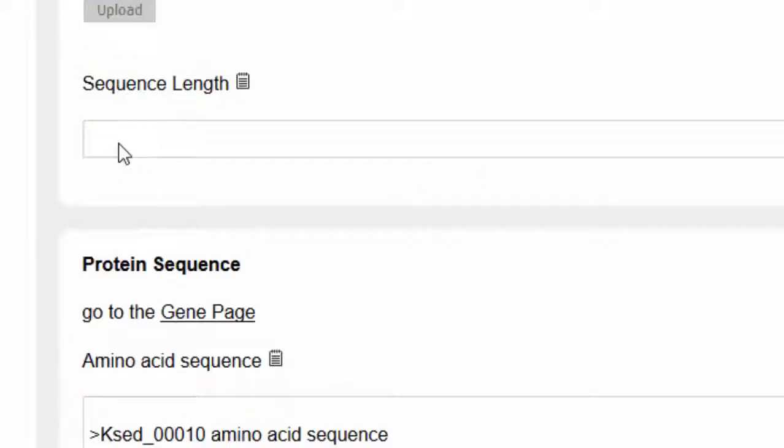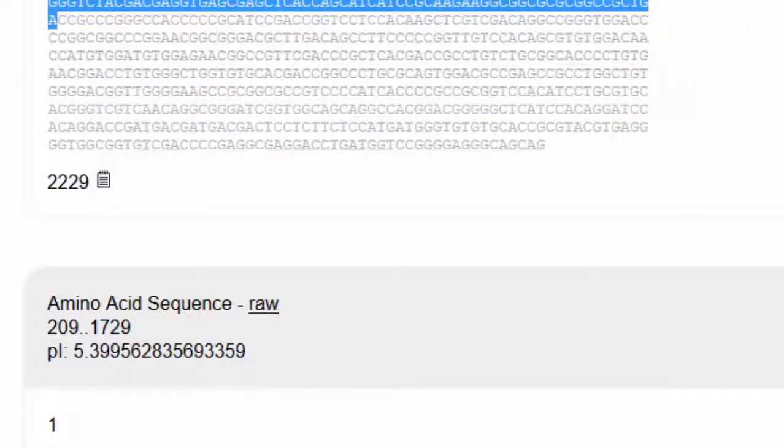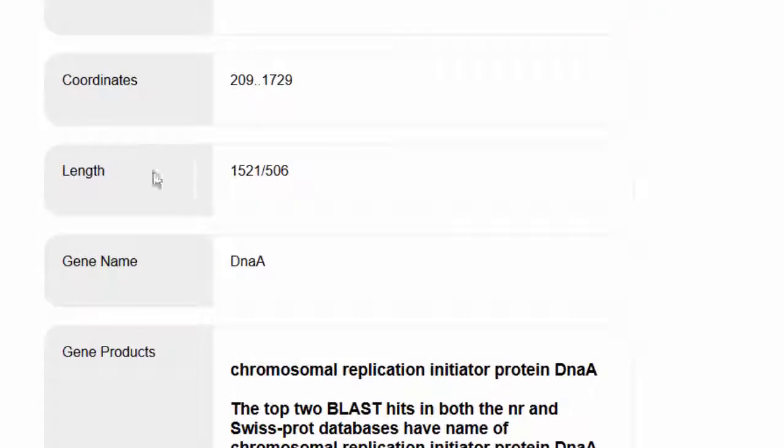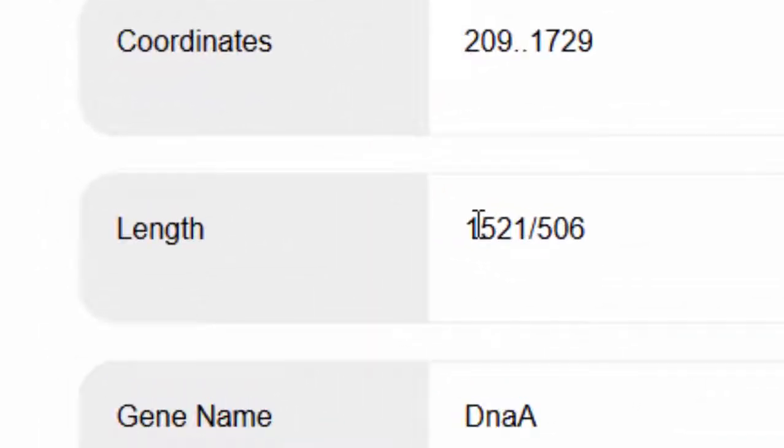The last part is about sequence length. So I go back to my other tab. I'm going to look for the box that's labeled length. On my other tab, it would look like this at the top with that yellow caret. It says the length box, and I told you we'd be coming back to that. So I'm just going to copy that for now.